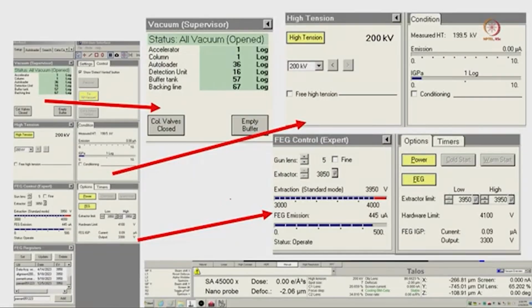If the position changes from your eucentric height, it will change the focus of your sample. That is why z height tells you whether it is at your eucentric height or not. If it is not, you should change the position of your sample holder tip and keep it at the eucentric height. Now we will go to the next slide, where you can see the enlarged view.